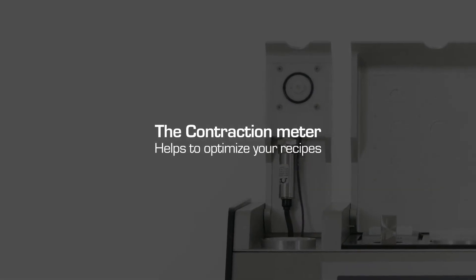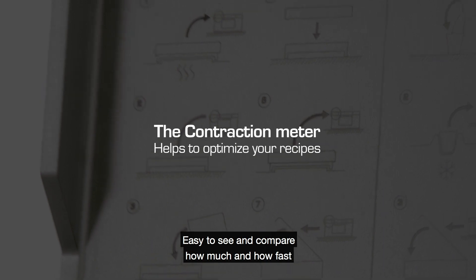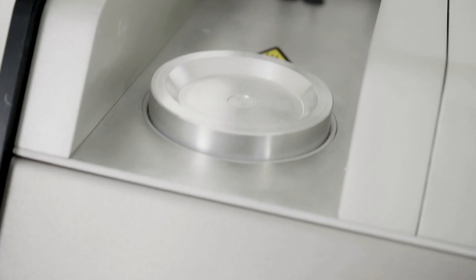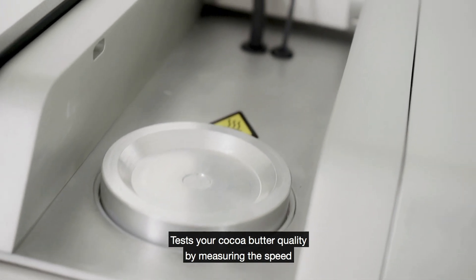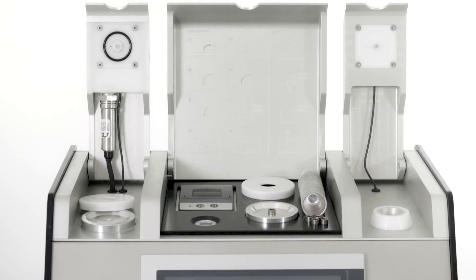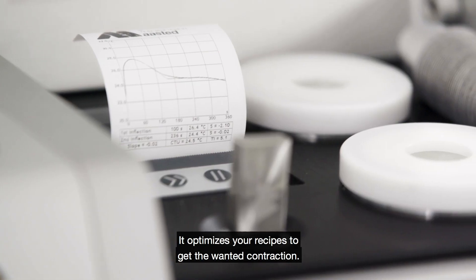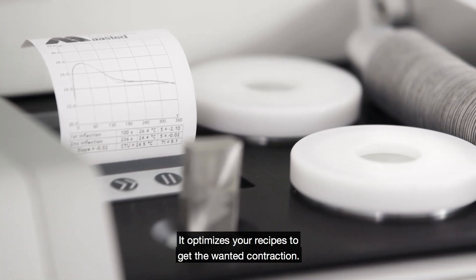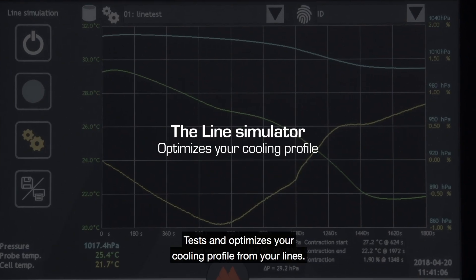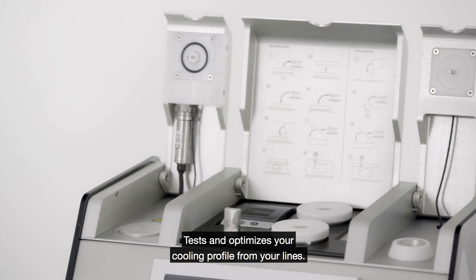The contraction meter: easy to see and compare how much and how fast your chocolate or filling contracts. Test your cocoa butter quality by measuring the speed of crystallization and total contraction. It optimizes your recipes to get the wanted contraction. The line simulator tests and optimizes your cooling profile from your lines.